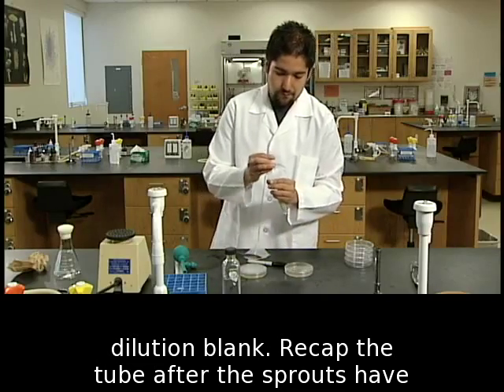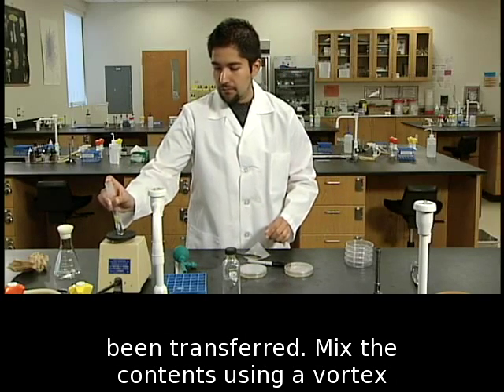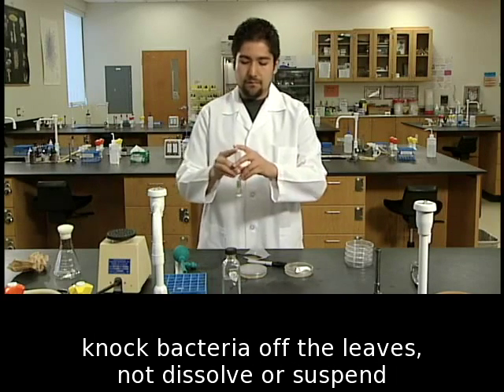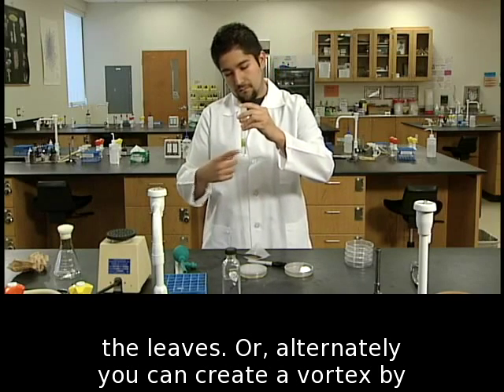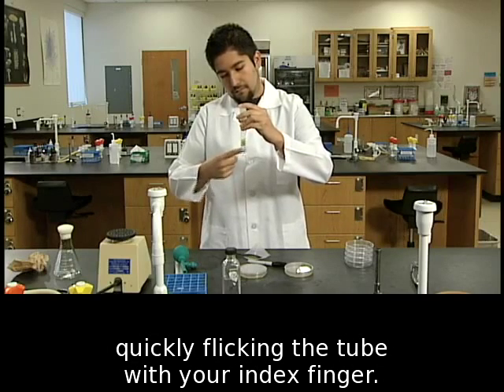Recap the tube after the sprouts have been transferred. Mix the contents using a vortex mixer. Hold the tube at an angle. You're trying to knock bacteria off the leaves, not dissolve or suspend the leaves. Or alternately, you can create a vortex by quickly flicking the tube with your index finger.